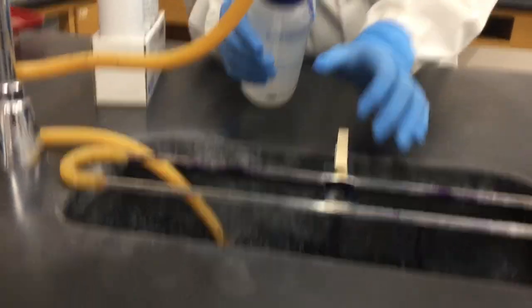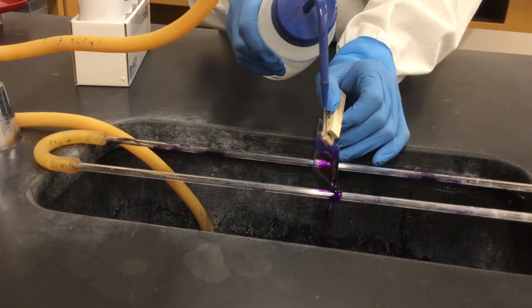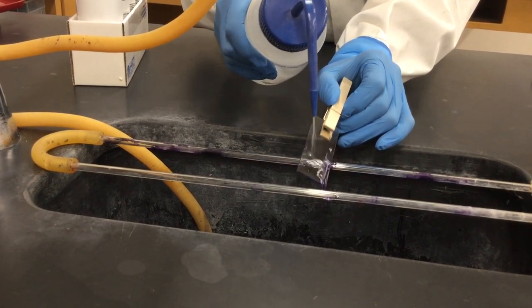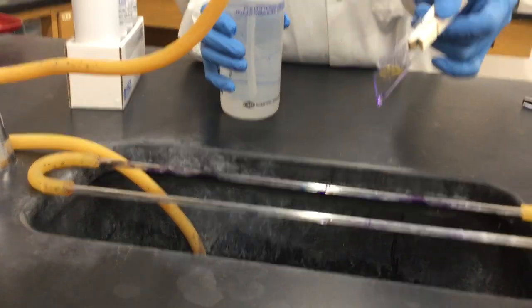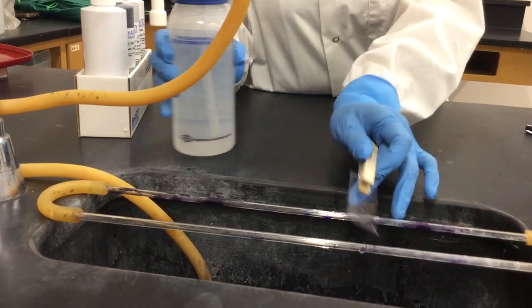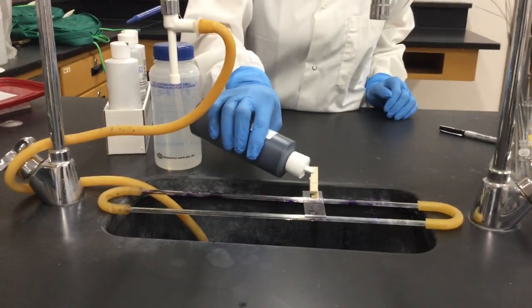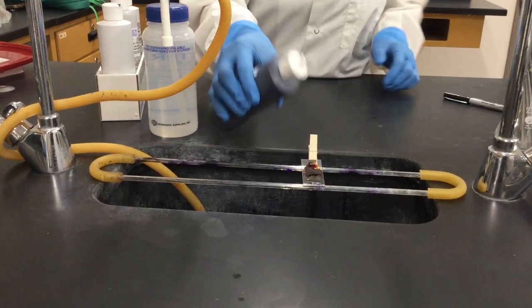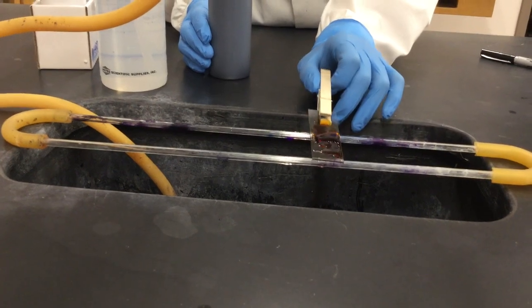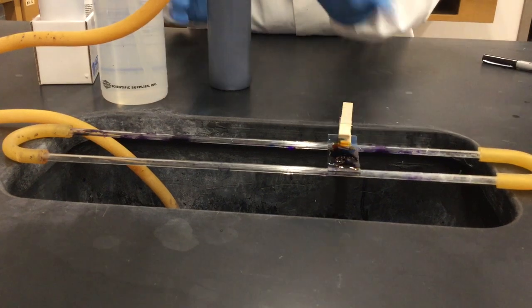So I think it has been 1 minute. And then you rinse it carefully. So you see how I angulate the slide there? And then you rinse it until you don't see any more remaining purple color from the crystal violet. Okay, now you add your iodide for 1 minute. And similarly, you don't over add the reagent, so you just distribute it with the motion of the slide.